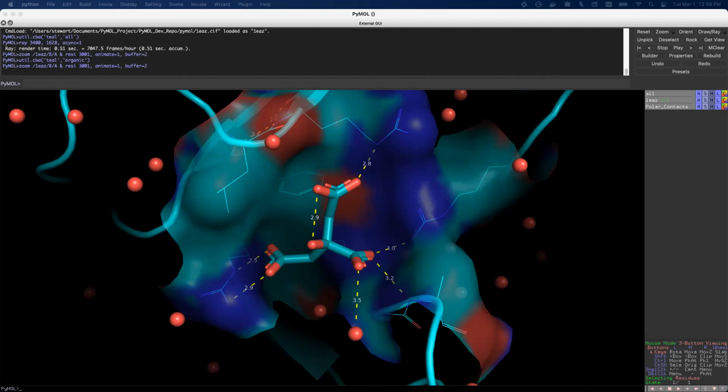We've got two more comment suggestions that came in. One from Janet Smith, that it would be great to display fewer symmetry mates or make it selectable sometimes. And another from Sandra Gabelli, and thank you for presenting, that exporting the presets as scripts would be awesome, as Rachel suggested. So definitely. Yeah, I think ultimately this highlighted that there should be several different options, and that's very helpful for me as I'm developing it.